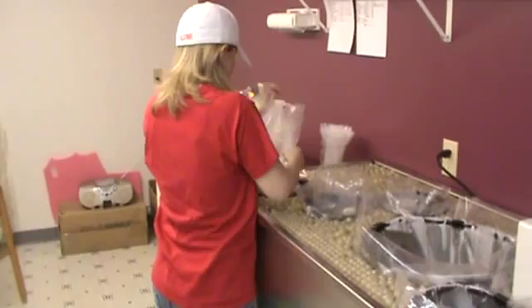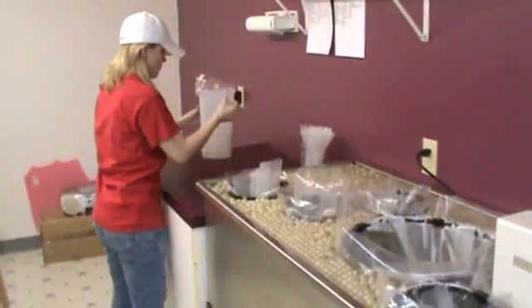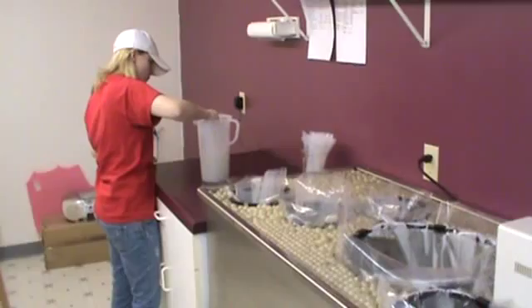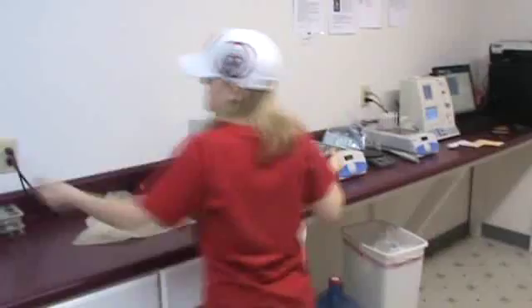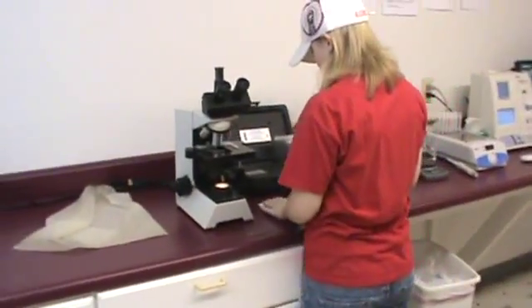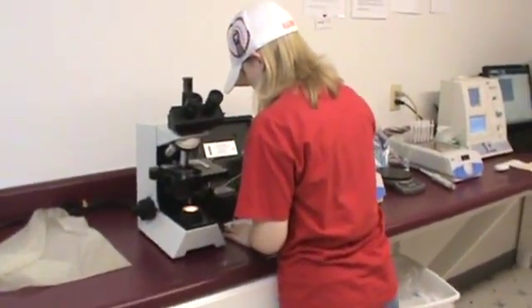Marissa will now be taking a sample just for a second eyeball check. We make sure every collection is checked twice — once by the computer and once by someone in the laboratory before it is shipped out. So she is taking her transfer pipette and walking over to our microscope. She will prepare just a little sample here on our slide warmer. We have got all of our slides on there already warmed up.